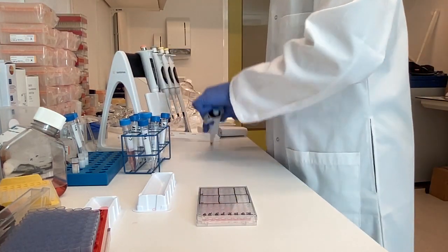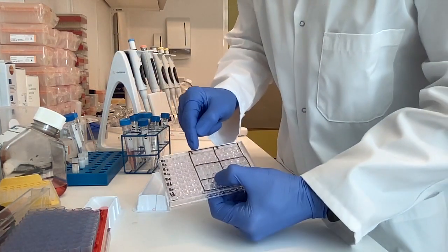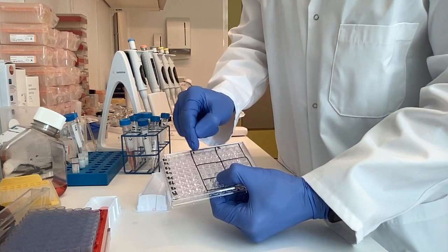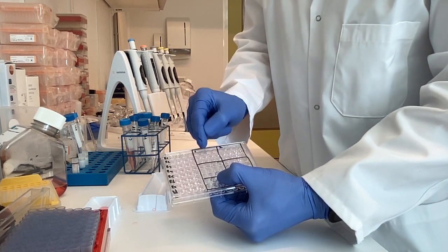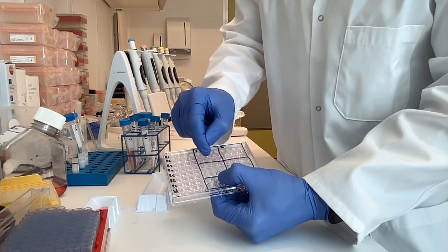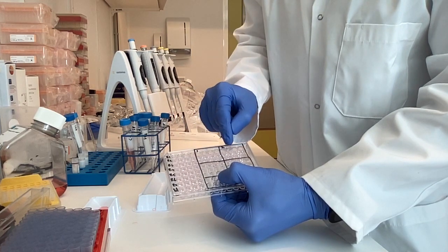Alright, so now we have prepared the non-spiked samples in the 3 different concentrations. The highest concentration is the 1 to 50, and we diluted it twice, so 1 to 100 and 1 to 200 for both sample 1 and sample 2.